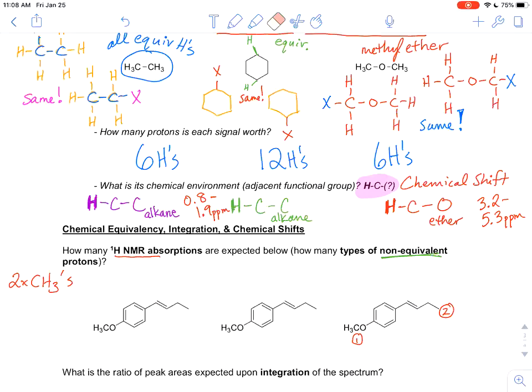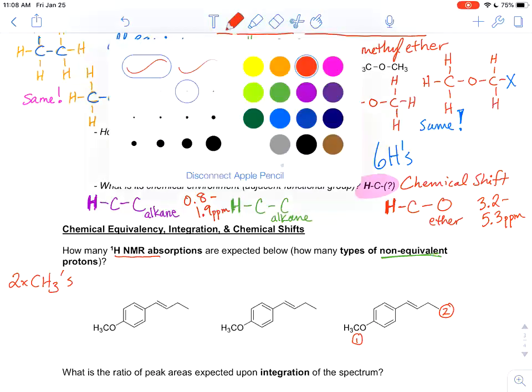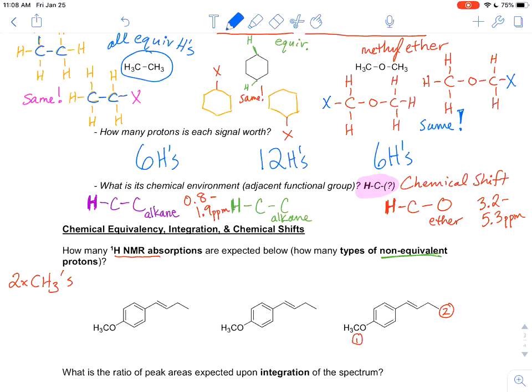Okay, so just clean those up. Now let's go to the CH2s, the methylenes. We have only one. Let's see how many CH2s. There's actually one CH2 group. This guy right here has 2 hydrogens.